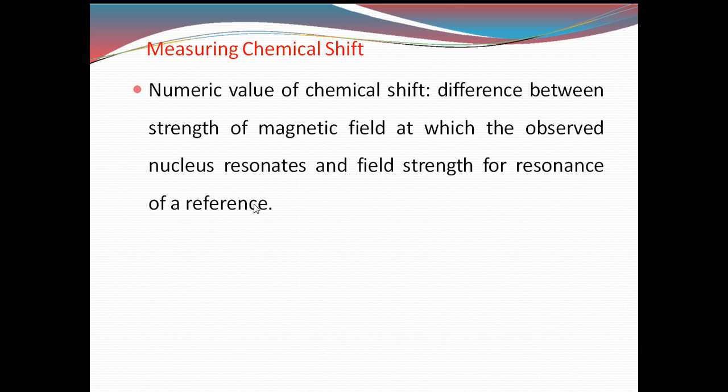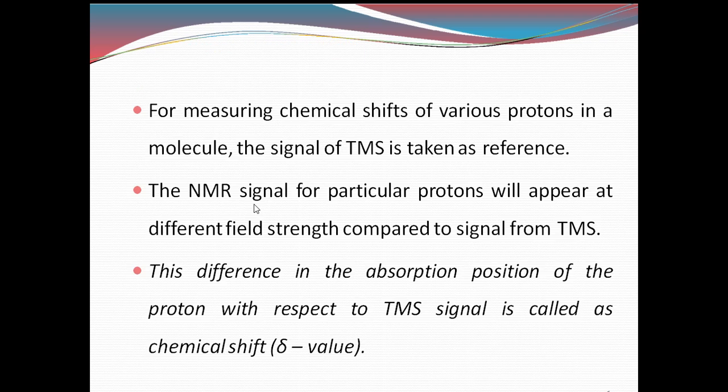Then you have to compare. Whenever you are finding whether a compound is correct or not, you will always compare with the standard one, isn't it? In the case of calibration also, you will compare with the standard only. So in this case, the chemical shift can be shown or expressed by comparing with the reference one.